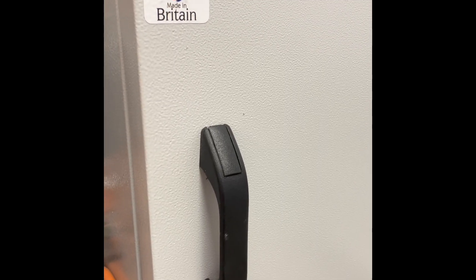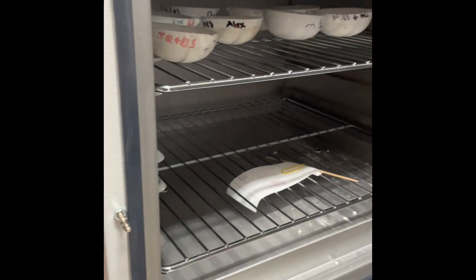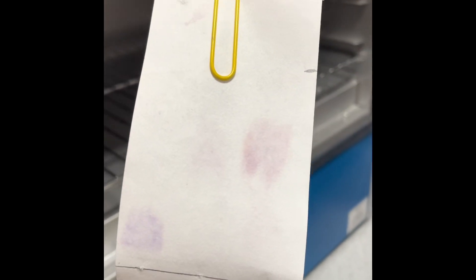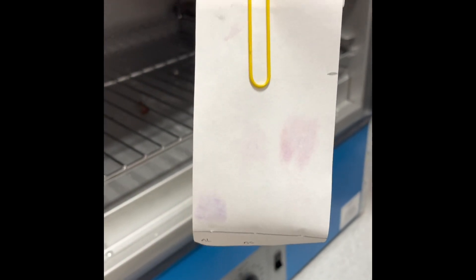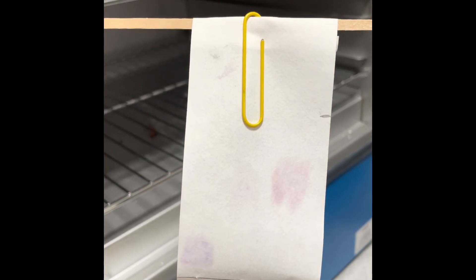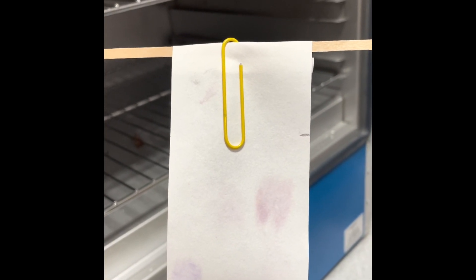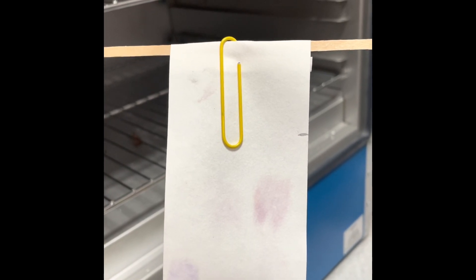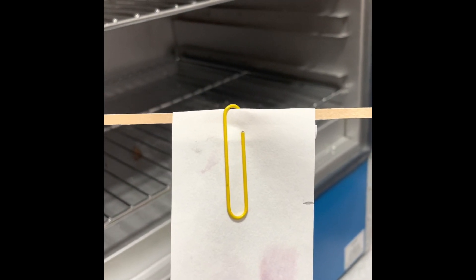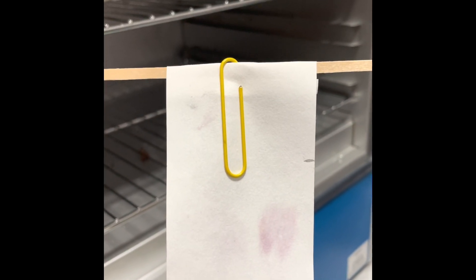It's been roughly 15 minutes in the drying oven. Looking at the chromatography paper now, you can see three dots: one on the bottom left, one on the right, and one in the middle. The right and middle dots are at nearly the same position, with the middle one slightly lower than the right. The next step is to draw a line through the centre of each coloured section so we can calculate the RF factor.